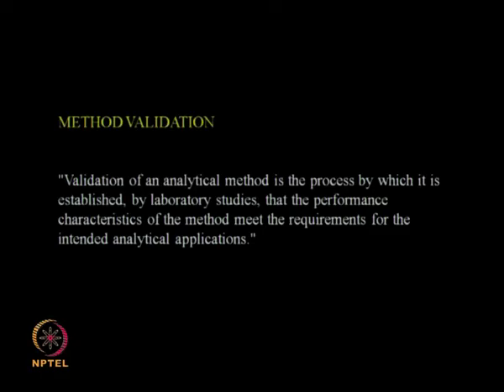So method validation is the process by which it is established by laboratory studies that the performance characteristics of the method meet the requirements for the intended analytical application.